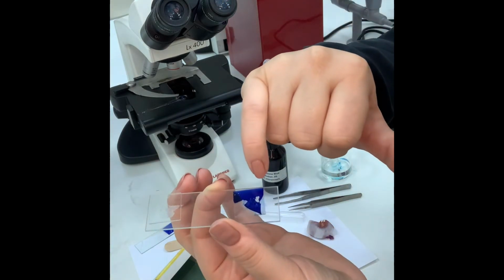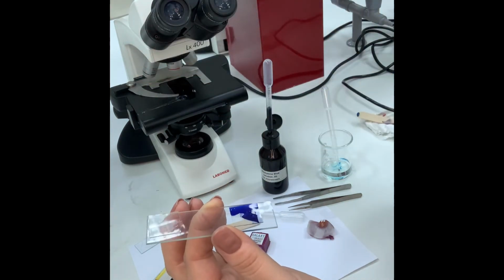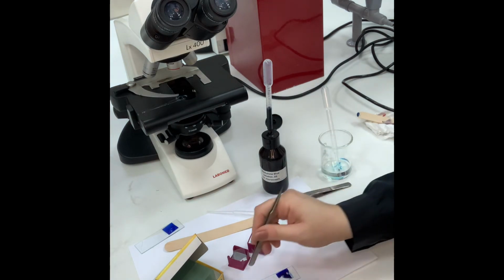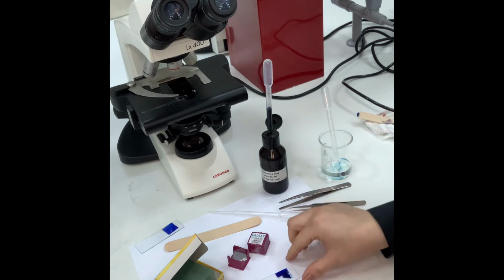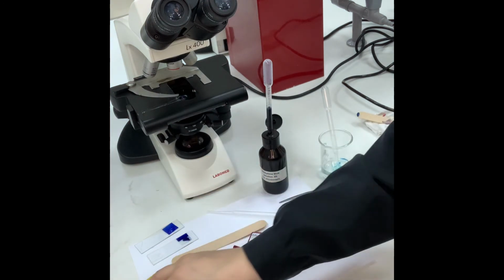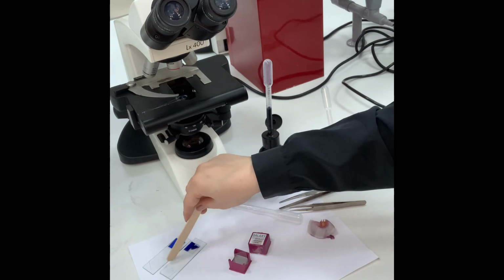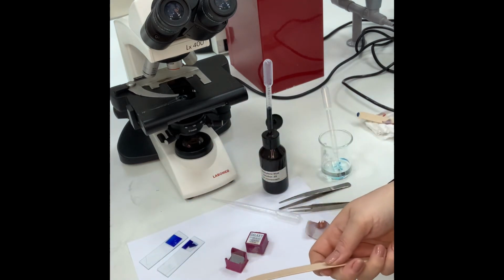I will try to tap to remove this air bubble, and then it is ready to use under the microscope. See, I will just tap it. No air bubble. And this is cheek cells and onion cells ready to view under the microscope.